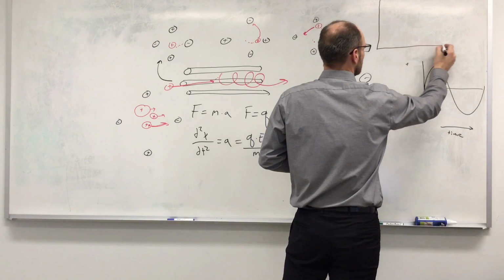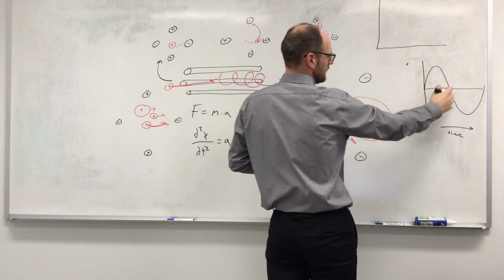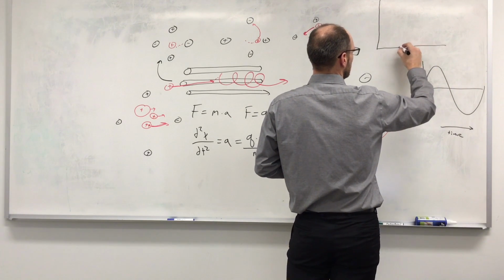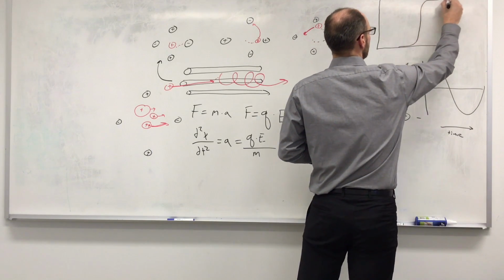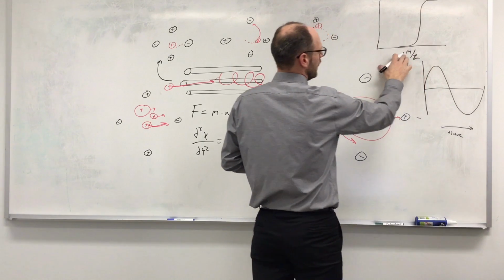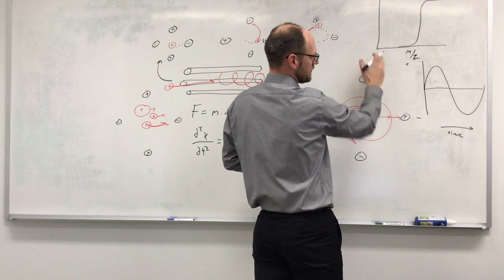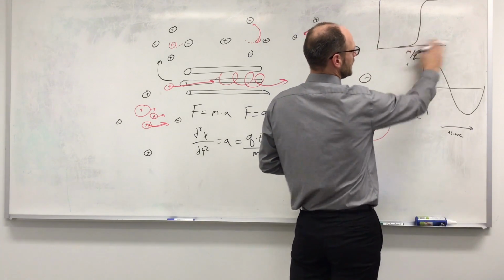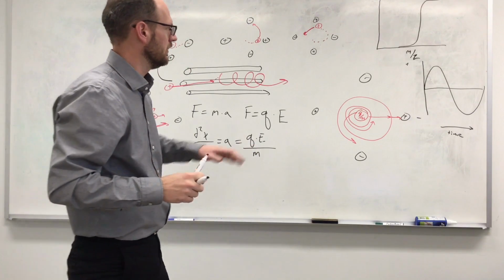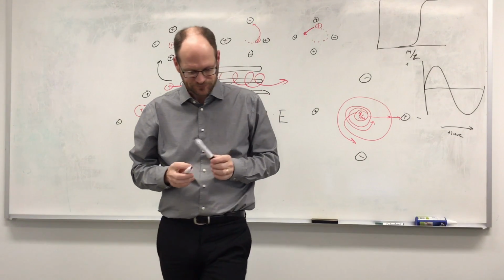Just by setting the electric field oscillation rate properly, you can make it such that anything lower than a particular molecular weight, or m over z, is filtered out. All the small stuff is destroyed because it runs into the quad, and all the big stuff makes it through because it's sitting in the center of the instrument. So this is allowing you to create a mass filter that only allows large masses through.